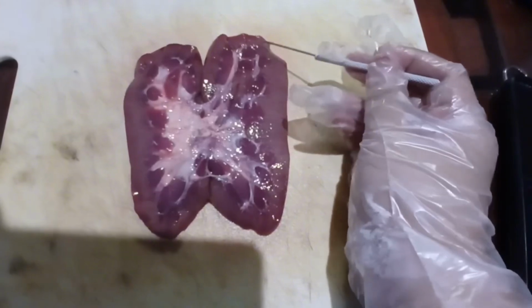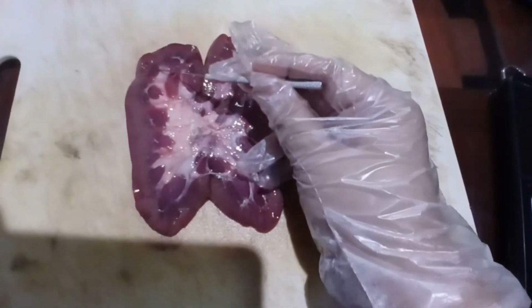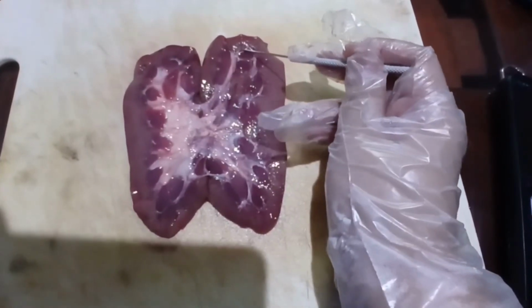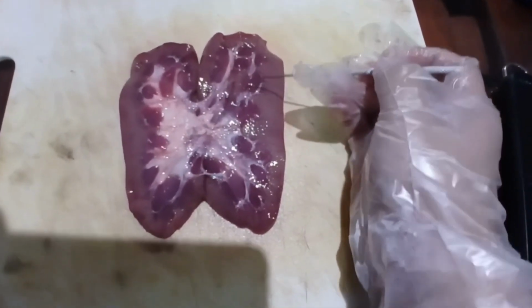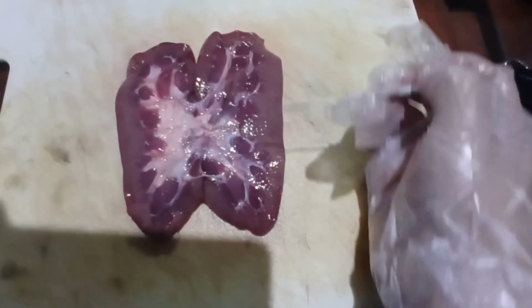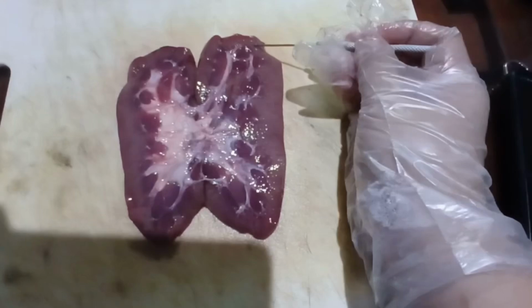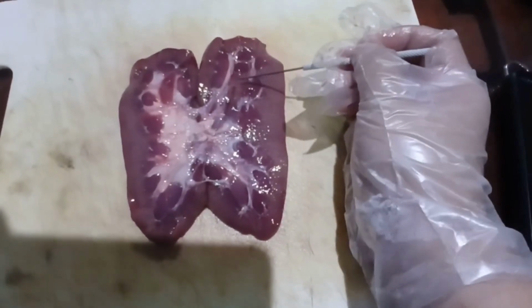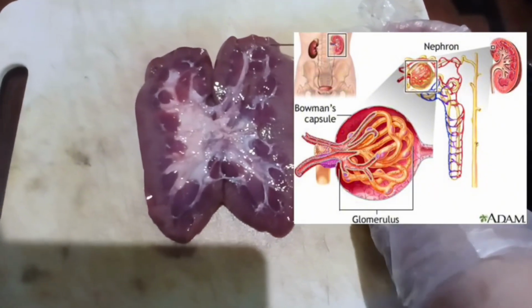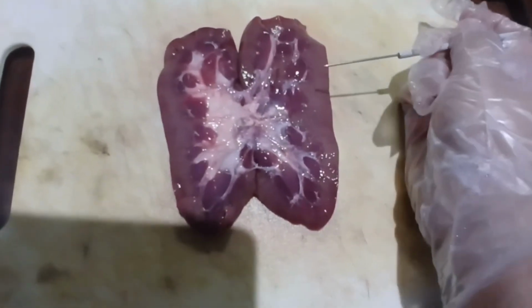Then we have the cortical radiate artery over here. The renal cortex is the outer layer of the kidney, and these arteries supply the blood to the nephrons, the functional units of the kidney. This is what we call the nephrons.